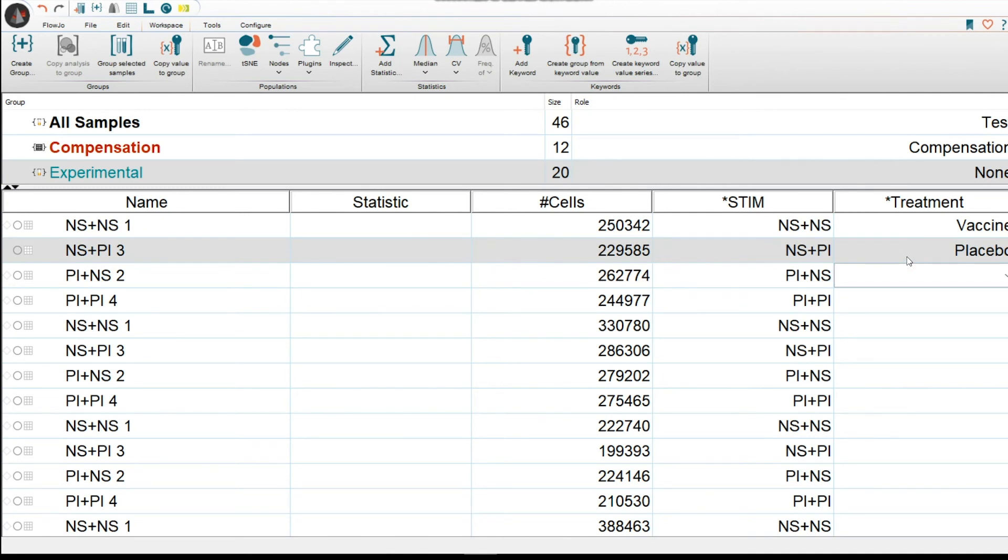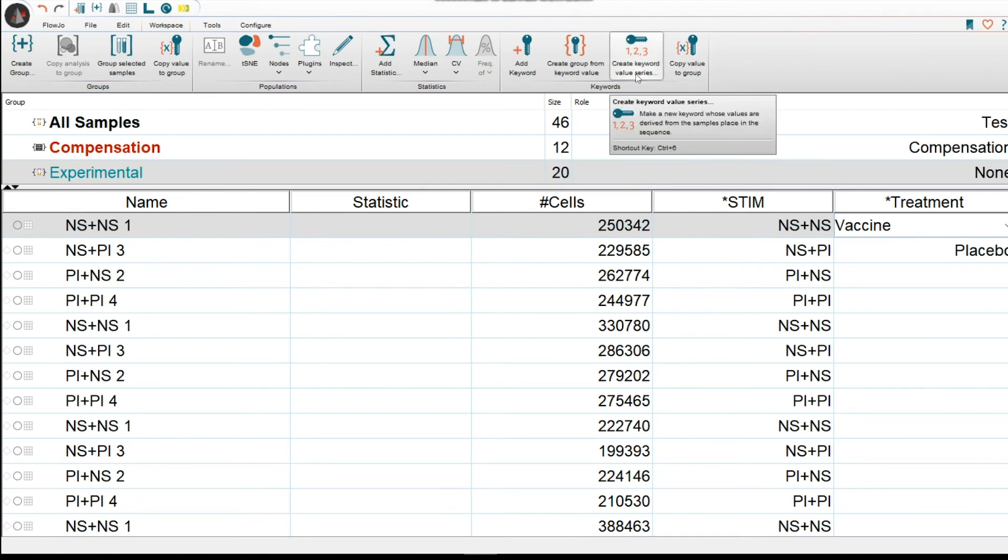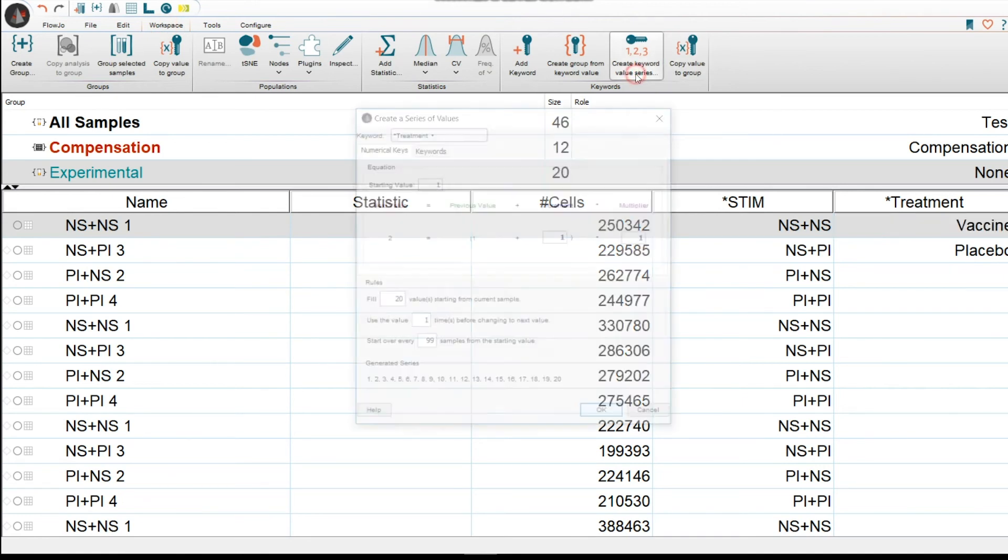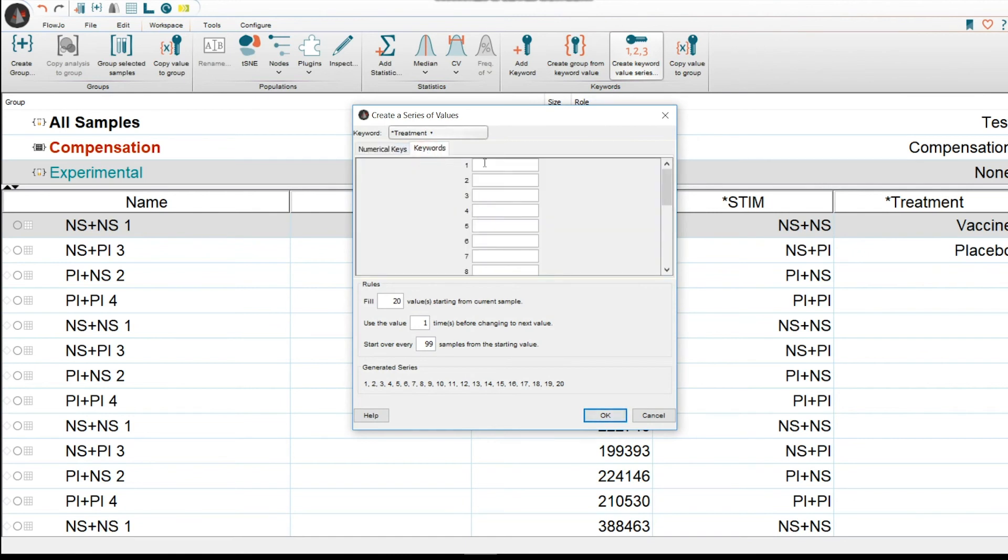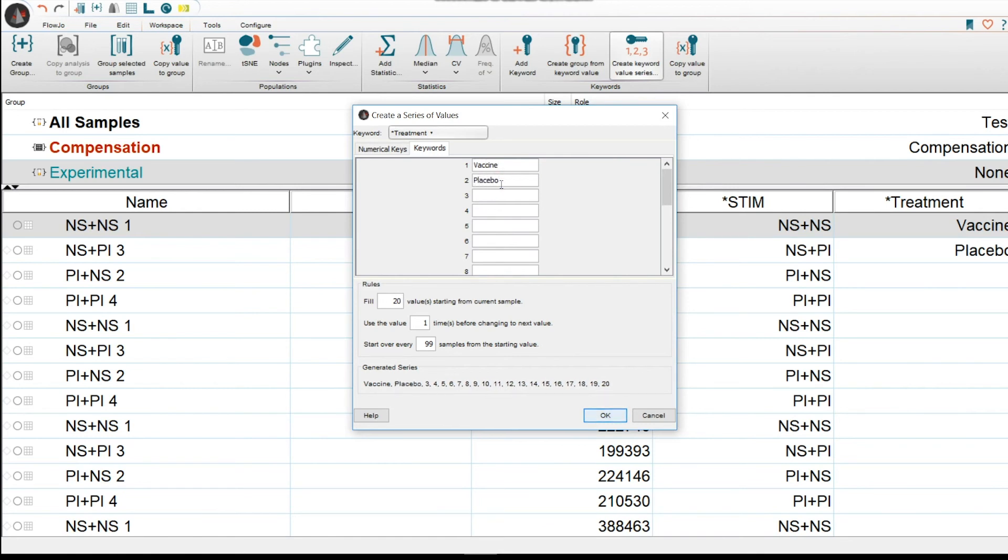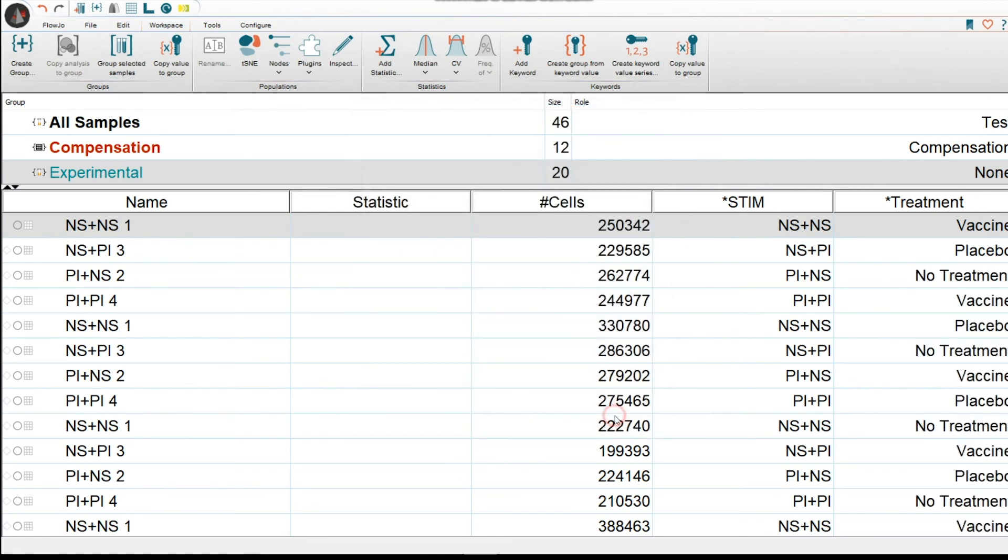How do you set up that series? Well, let's select that keyword and then go to Workspace and then Create Keyword Value Series and then click on it. Then you would select on Keywords and then let's type in that pattern. Vaccine, Placebo, and let's just say also No Treatment. OK. The next thing we're going to say, well, we want this to start over every three samples. And here you can see the pattern that would be showing up with all your samples. We're going to press OK and there you go. Everything is now in that specific pattern.